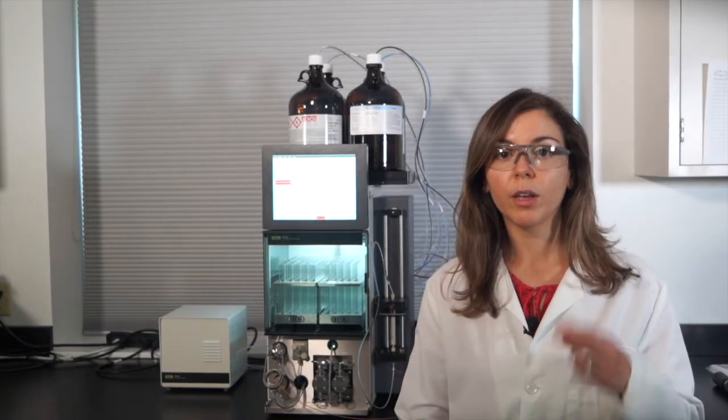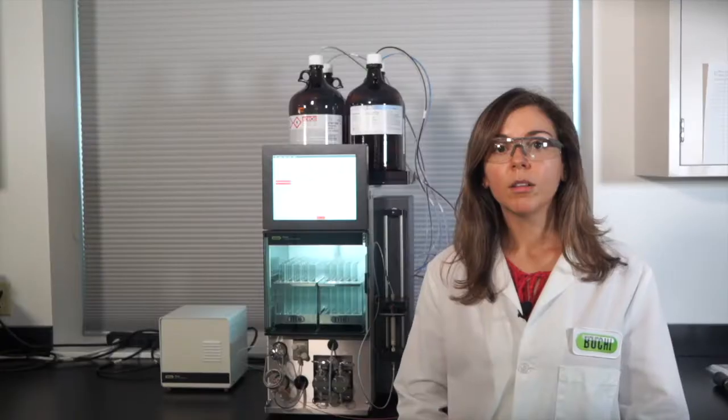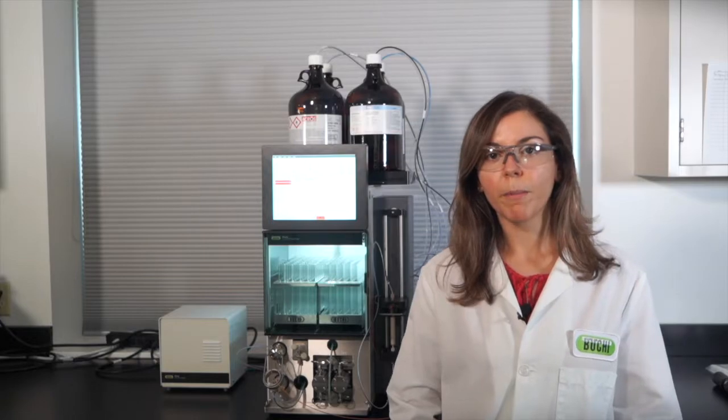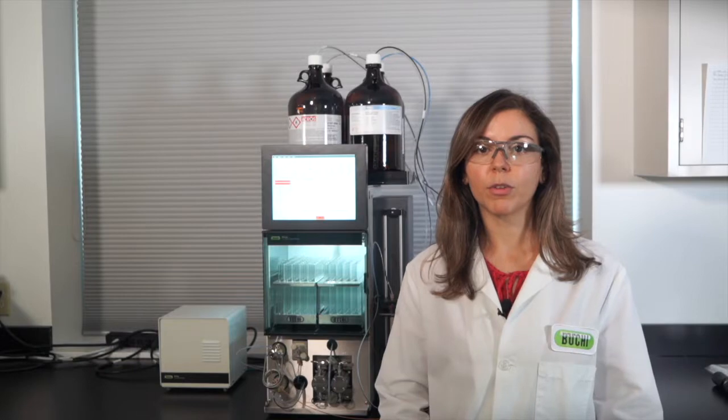The Pure features three convenient USB ports, two on the back and one on the side of the instrument for easy access. To gain fine control, a keyboard and mouse may connect for faster typing and navigation through the software. The USB port on the side of the Pure is great for connecting a USB storage device to transfer run data to include in lab reports.